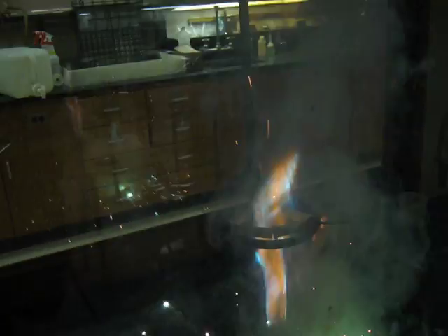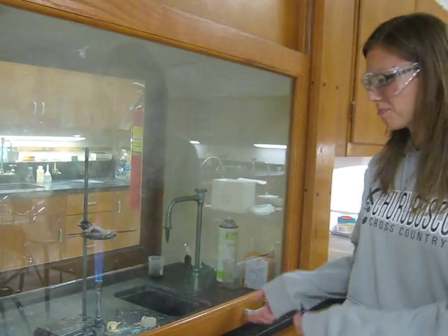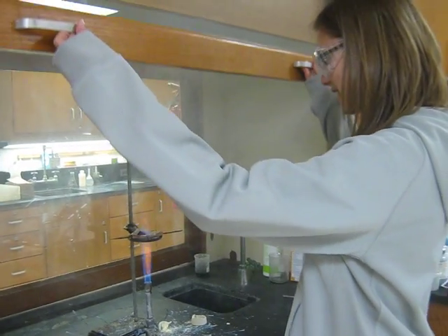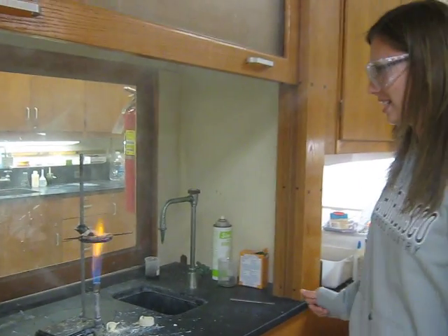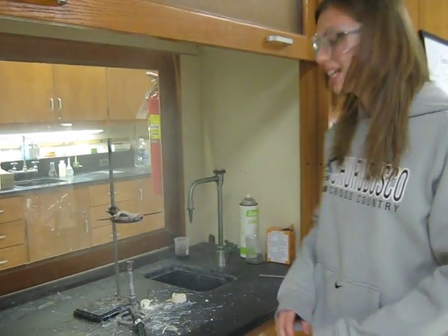You notice that there was a big green flame, which indicated that Zinc was being oxidized. The three chemical reactions in this lab were: Zinc and Sulfur to produce Zinc Sulfide, Zinc and Oxygen Gas to produce Zinc Oxide, and Sulfur and Oxygen Gas to produce Sulfur Dioxide.